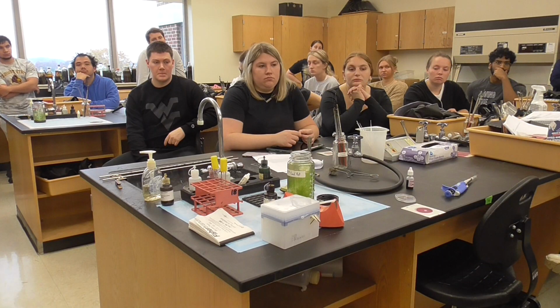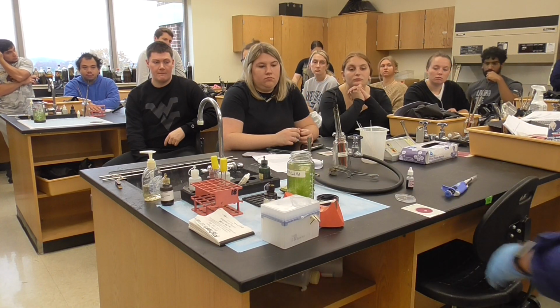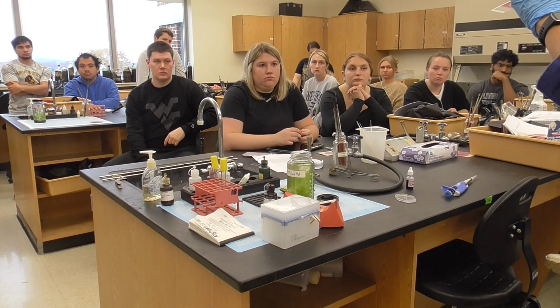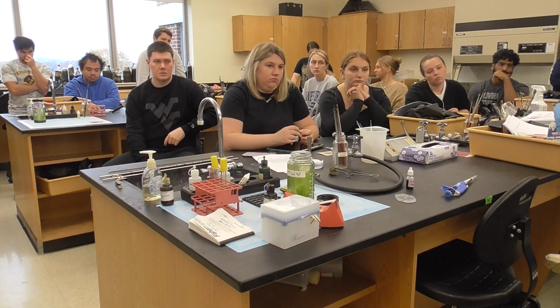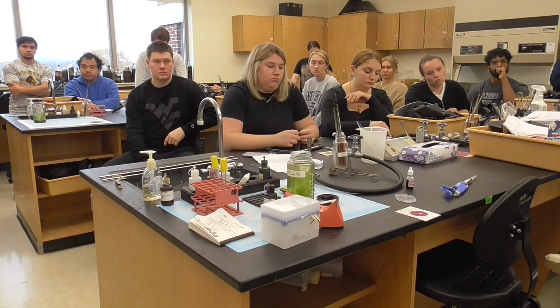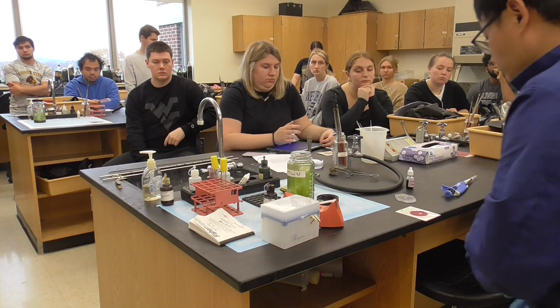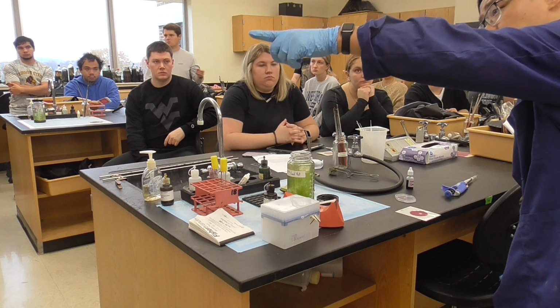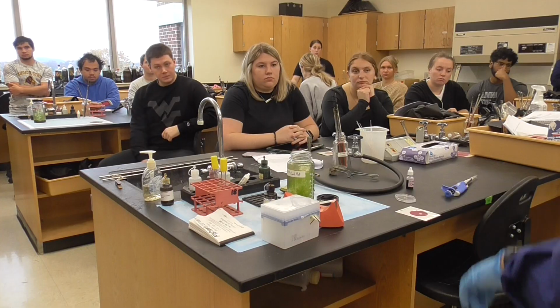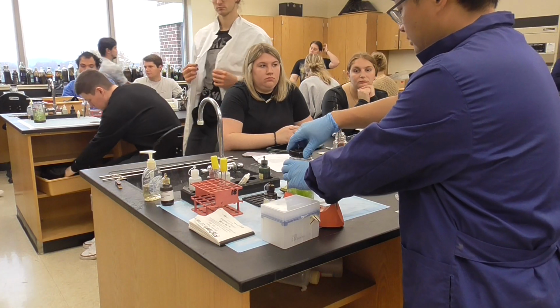What we are missing here is a label. So what we should do, before you do it, label on the top. You name the bench number, dilution factor. It's all pond water, so everybody knows. This will go to incubation. And on Tuesday next week, we want to see the coliform, generic E. coli, and the total coliform. Okay? That's the work we're going to do.